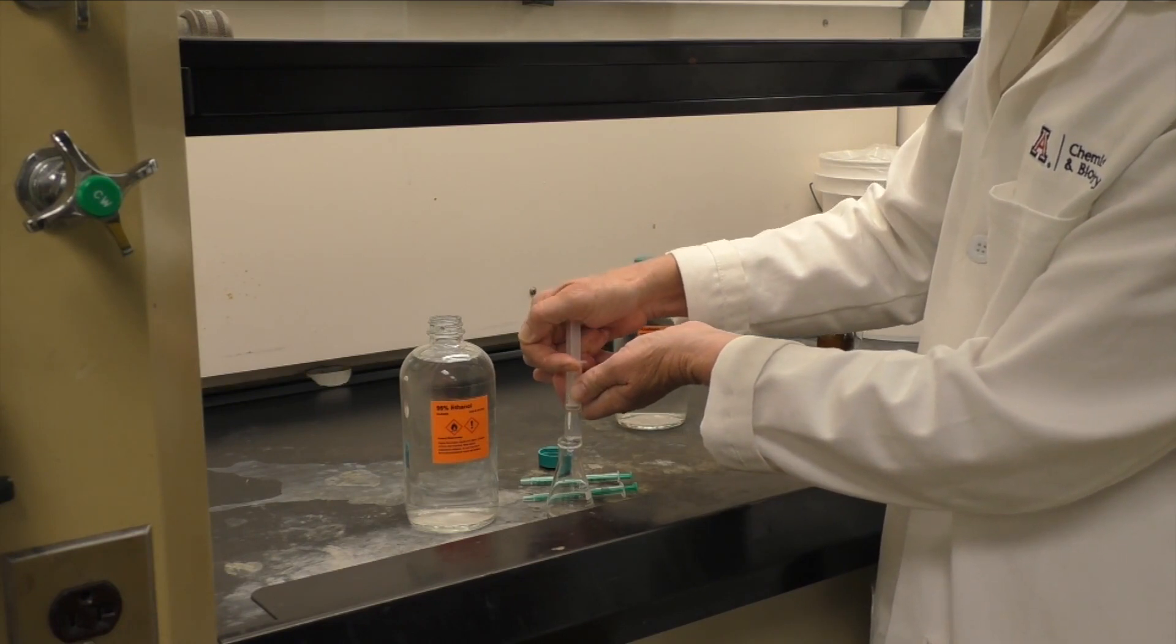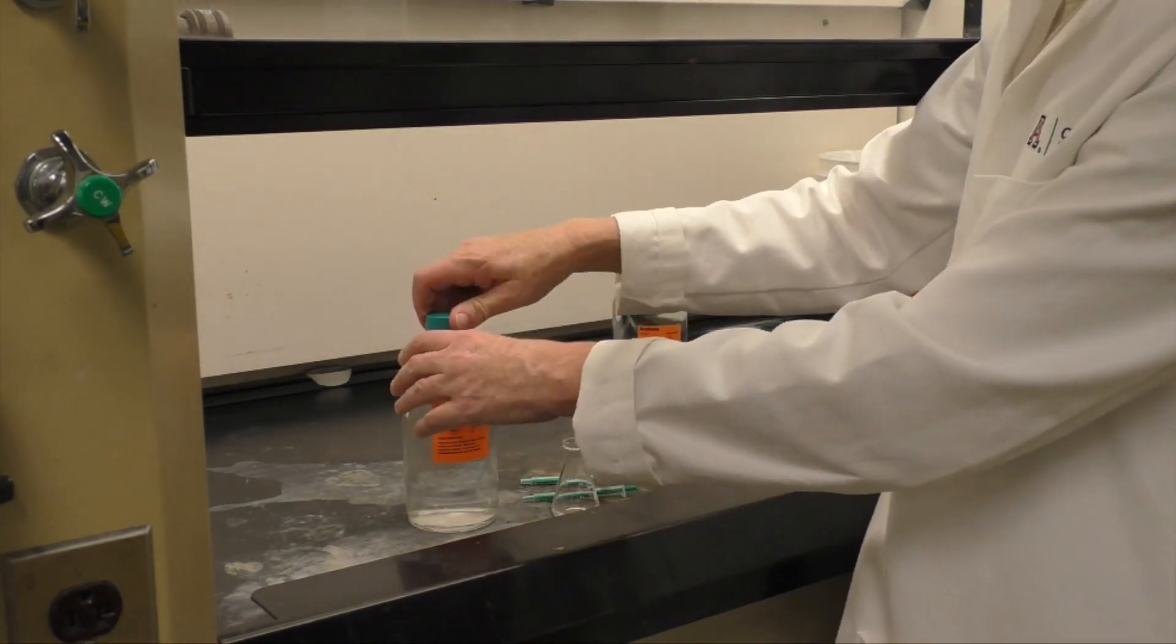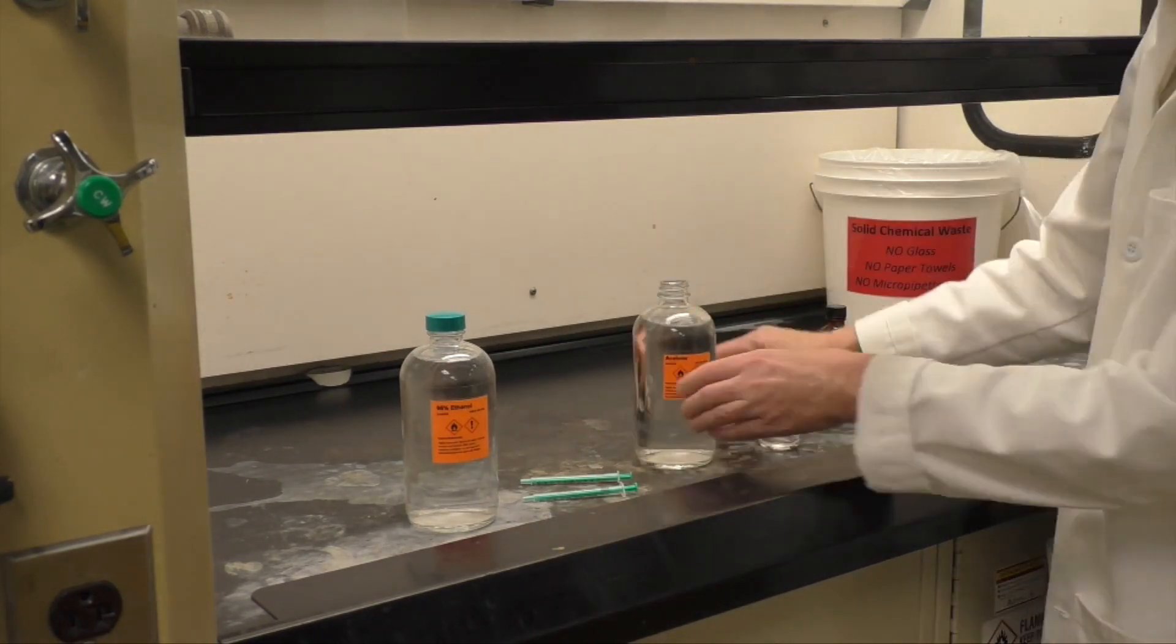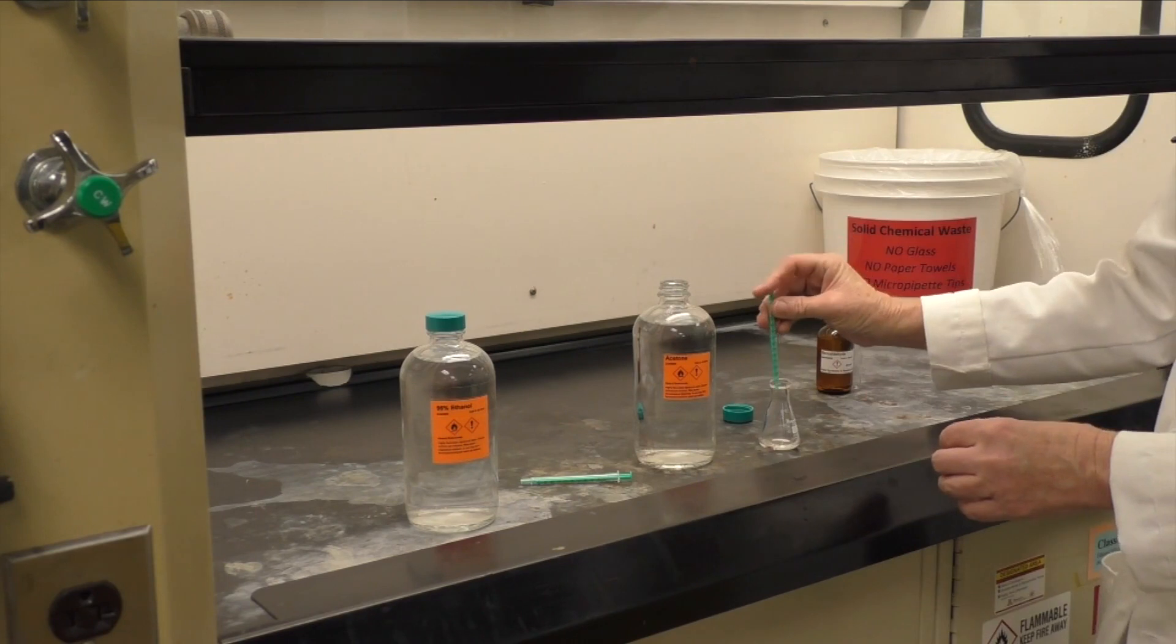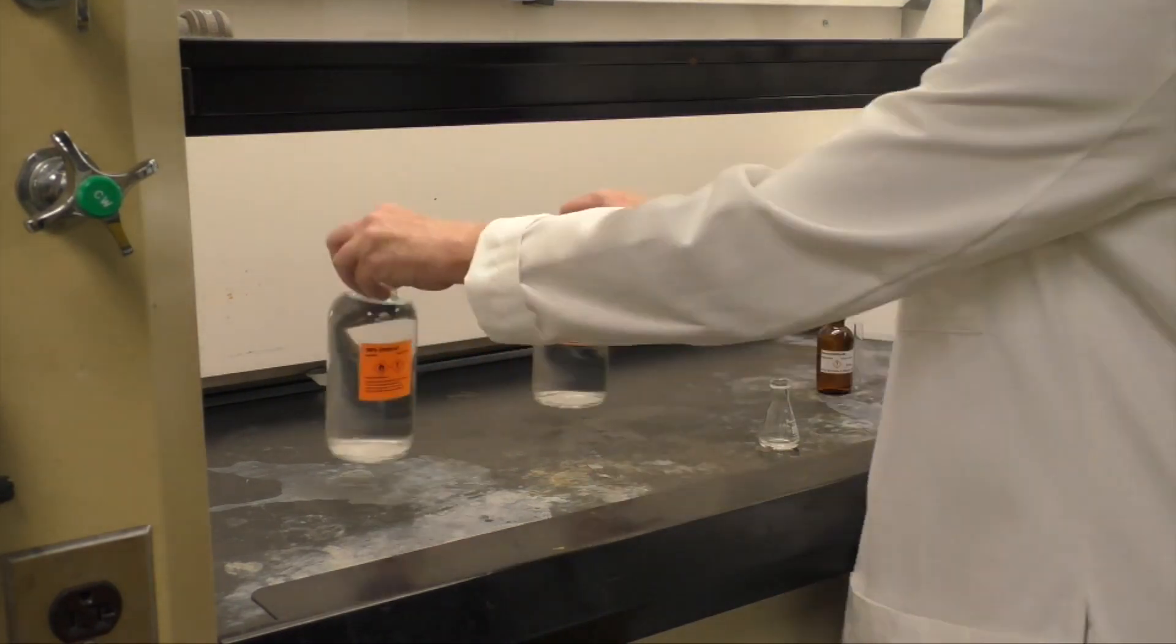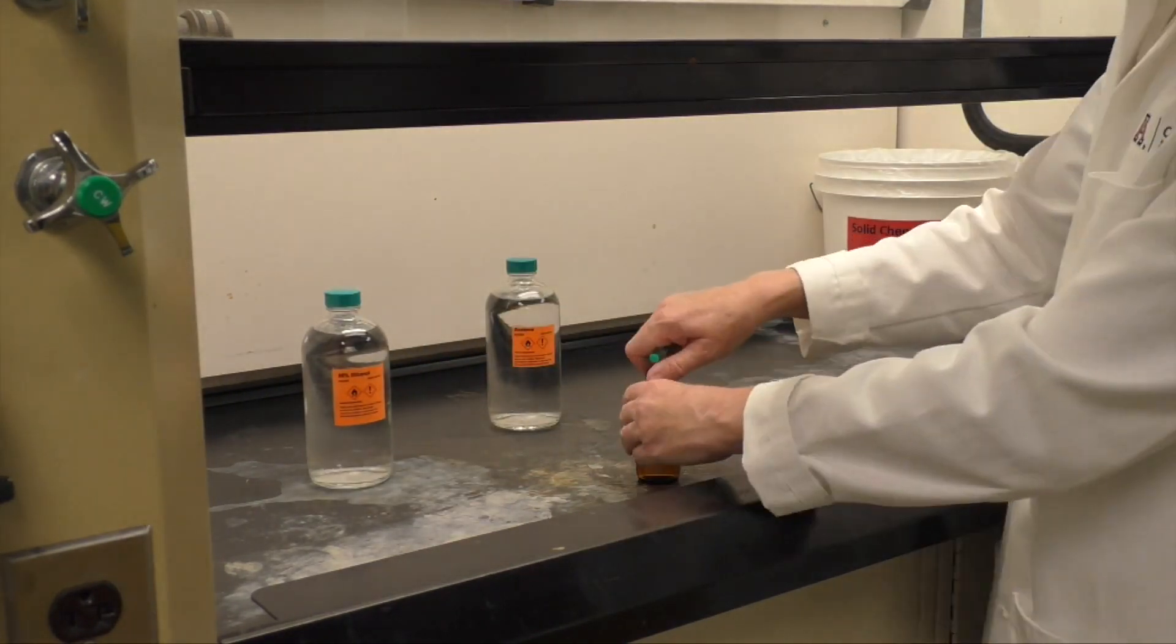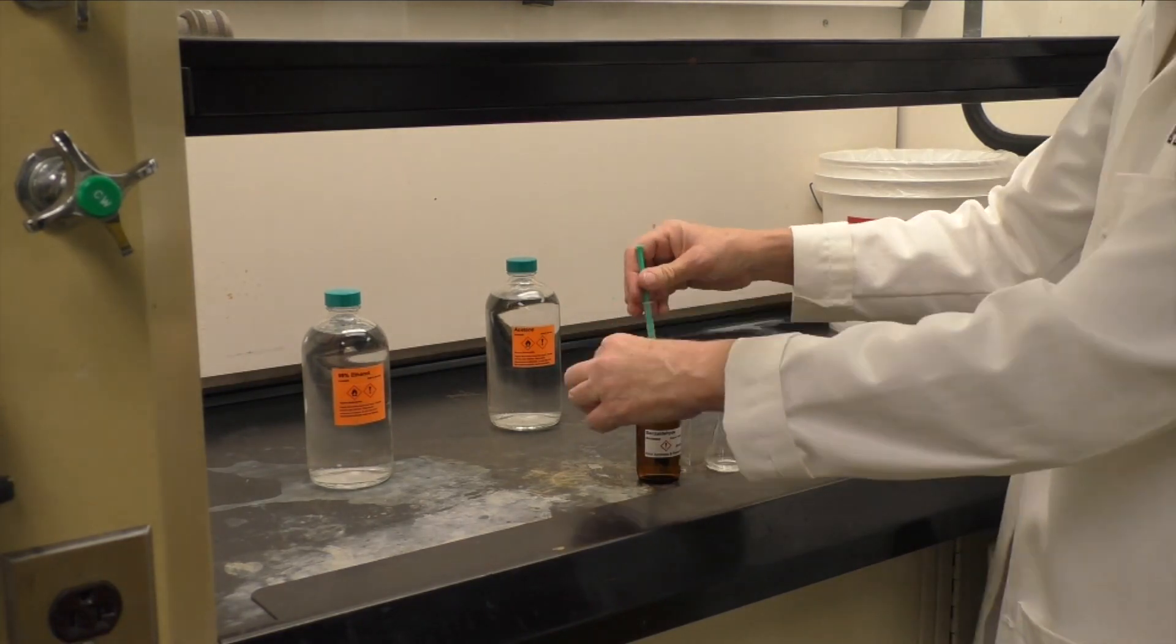Then add 0.148 milliliters of acetone. Here we're adding 0.448 milliliters of benzaldehyde. Remember that you will be adding your calculated amount of your assigned aldehyde.